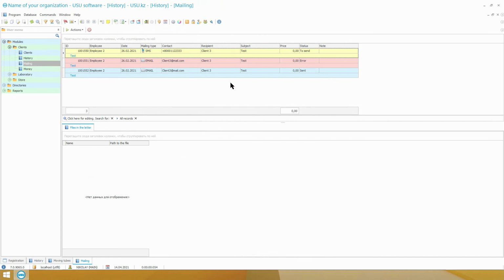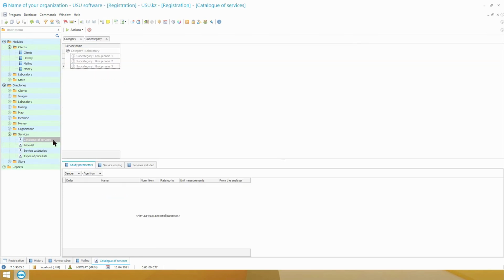The third way is the most progressive, to download test results from the laboratory website. This method is implemented on demand. Each patient gets a code word printed on the receipt, which he or she enters on the website and downloads the test results.